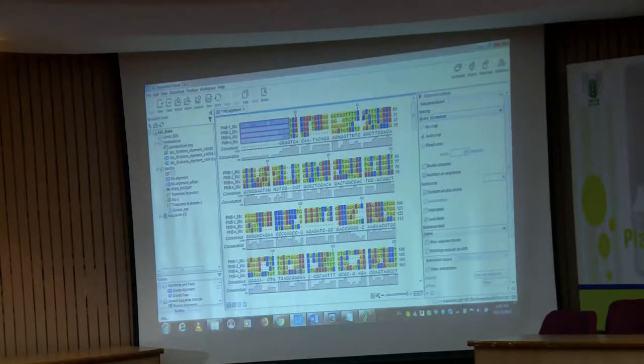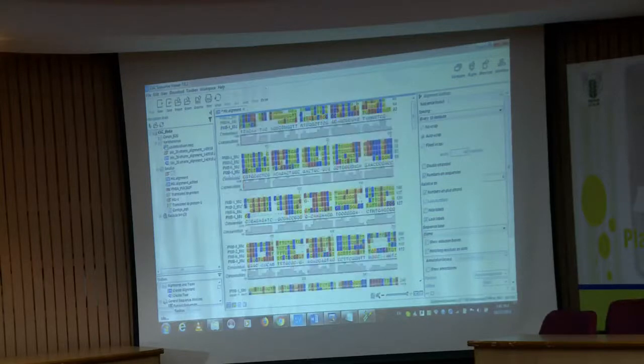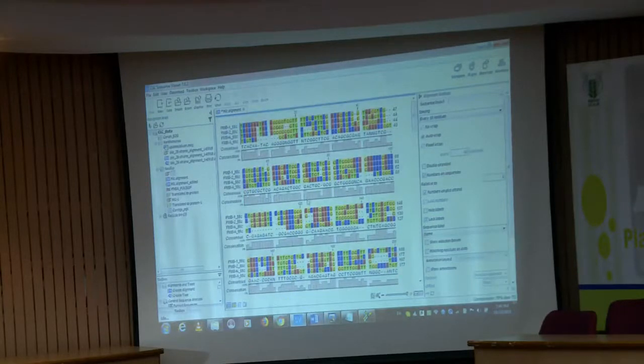From now on, it is getting uniform, for example, right. So, now this T is uniform, so what I will do, I will select all the sequence, right click, delete selection. Now what happened, the non-uniformity is cleared. Now, all bases are starting from one point, right.